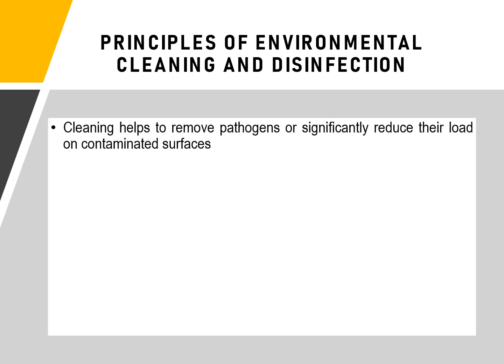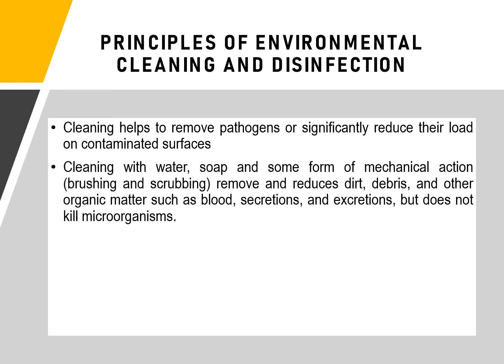So cleaning helps to remove pathogens or significantly reduce their number on contaminated surfaces. Cleaning is an essential first step in any disinfection process. So you don't immediately perform disinfection on a contaminated surface. You still have to perform cleaning or removal of any debris before applying the disinfectant.